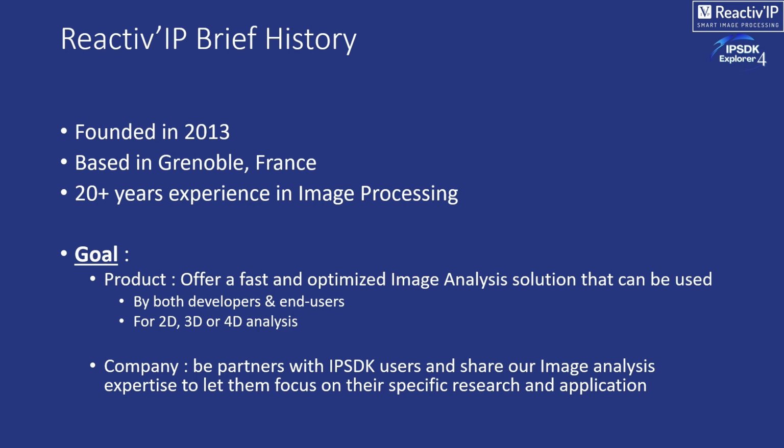We wanted to propose a performant solution for all these types of users, but also for any type of image acquisition device, from optical microscopy and electronic microscopy in 2D, to electronic microscopy in 3D, like in FIB-SEM or Tomo TEM, and also X-ray 2D or X-ray 3D, like in tomography.